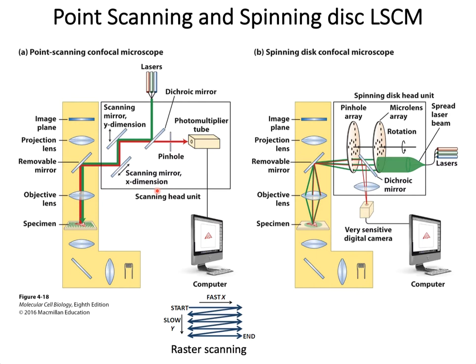Now, let's first understand what the microscope is going to capture as an image. Say your sample that you are going to image, the image will be a 2D image. Think this way, that when we have a photograph of an individual, it is a 2D representation of an individual who has the third dimension or thickness as well, but that is not there in a photograph. So the same way here we are considering a two-dimensional image of your specimen. So there are always two axes, X and Y, for any two-dimensional object. As we are not considering its thickness or third dimension, the Z-axis is omitted.